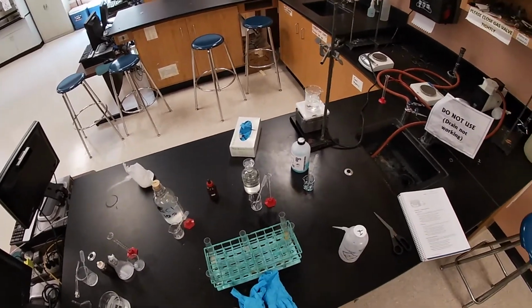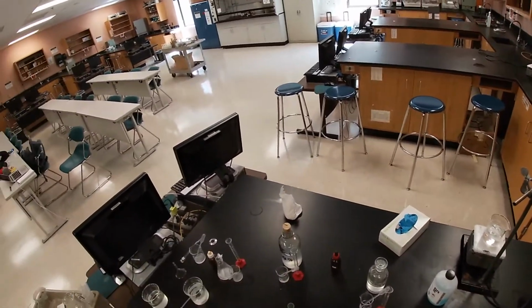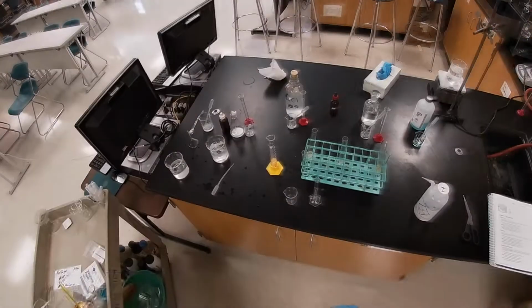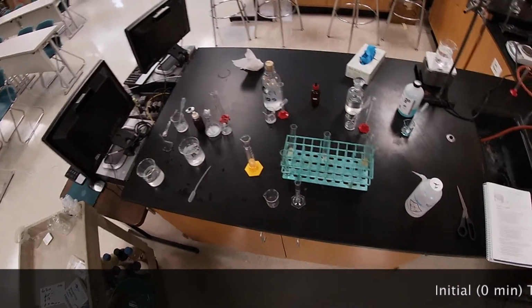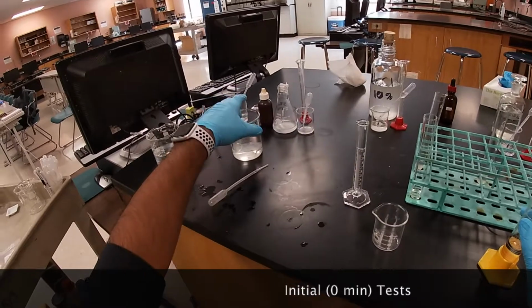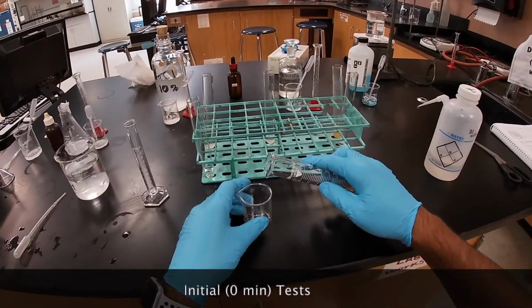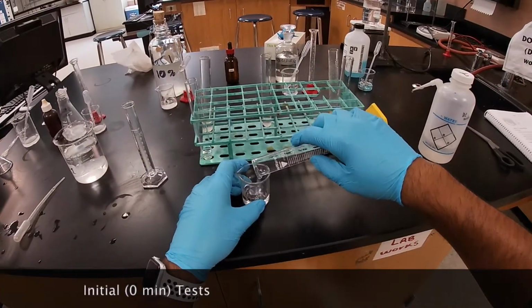So the water bath, I currently have it going on. I'm just gonna turn it up so that it can get to the boiling effect. And then we're gonna set up our 3 test tubes. Okay, so the next thing that we're gonna do is, initially we had measured out our 15 milliliters of our dialysis tubing mixture right here. And so the next thing we're gonna do is put it into a small beaker. Yeah, this is a small one.